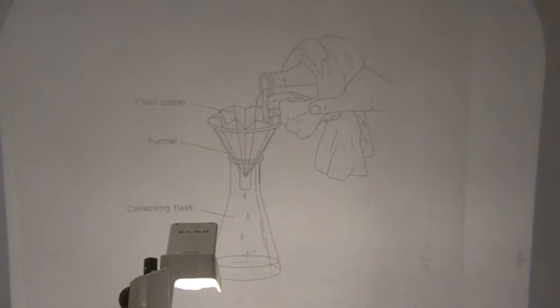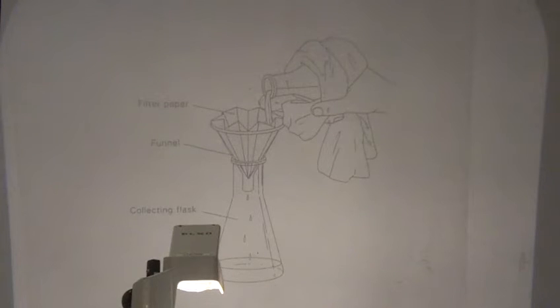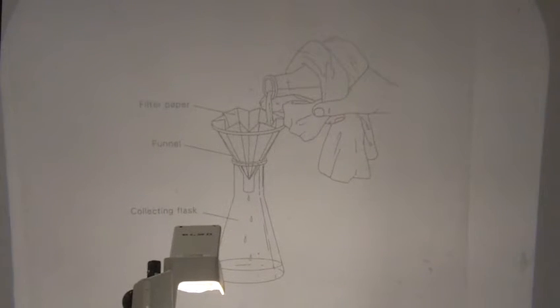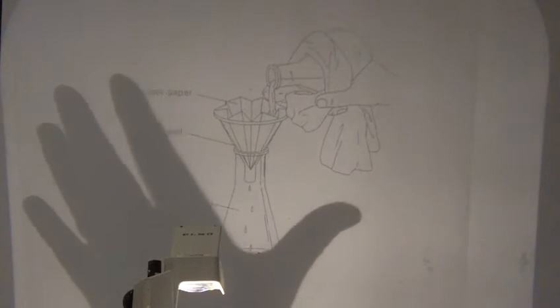With gravity filtration, what you guys are going to learn this week is how to flute filter paper, okay? That's a new technique for you, which is very useful to learn how to do well. There's multiple times that you'll be using it in lab, and it can kind of be therapeutic too. You're basically folding paper. It's kind of like organic origami. But you want to do a really good job at it so your filtering doesn't take too long, okay? If you do a good job, things will filter well. If you don't, things don't filter so well. So learn how to do the origami well.